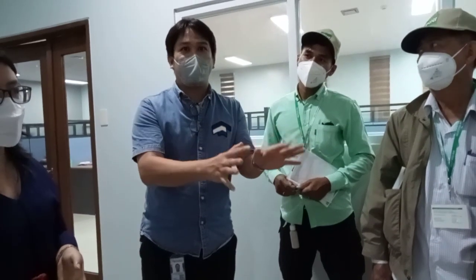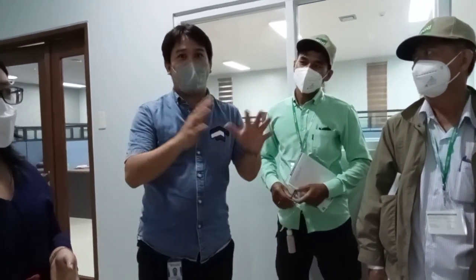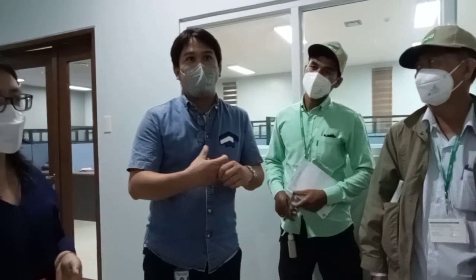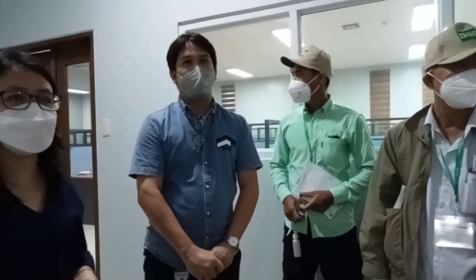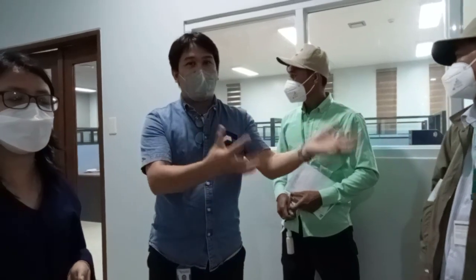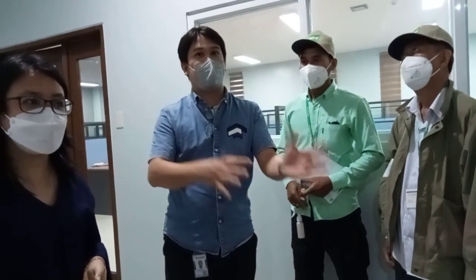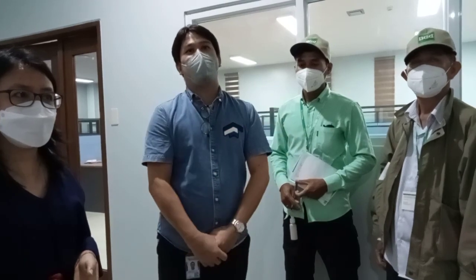And for those materials that are not hazardous, we just dispose them properly. But those that are hazardous coming from the lab, especially because we're using different chemicals and reagents, we have teams who take care of those hazardous materials. And there is a schedule that they come and collect those materials, and then it's documented, those lab waste that are coming up from our lab. And then they ship it for proper disposal.